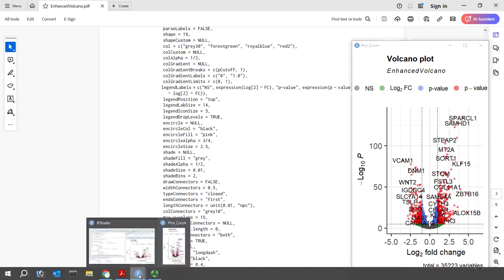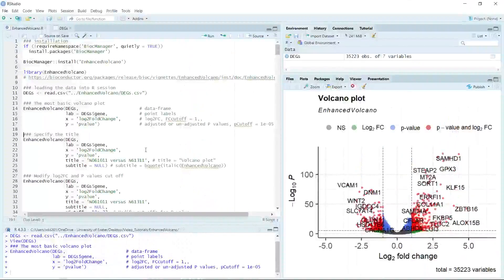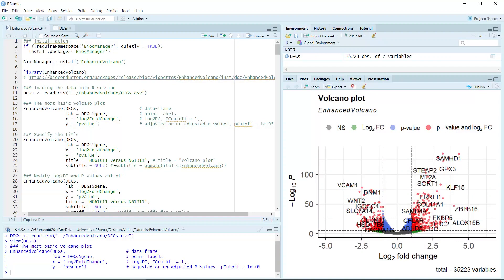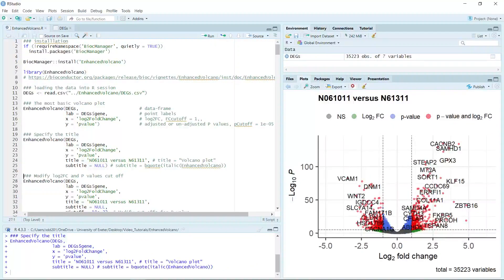Let's go back to RStudio. We made the basic volcano plot. Next I can show you how to change the title — we just use the title argument. Because this dataset was generated by comparing two samples, we can change the title to the sample name. The default title is 'Volcano Plot'. We can also remove the subtitle. After running, you can see we generated a new volcano plot with the updated title and no subtitle.